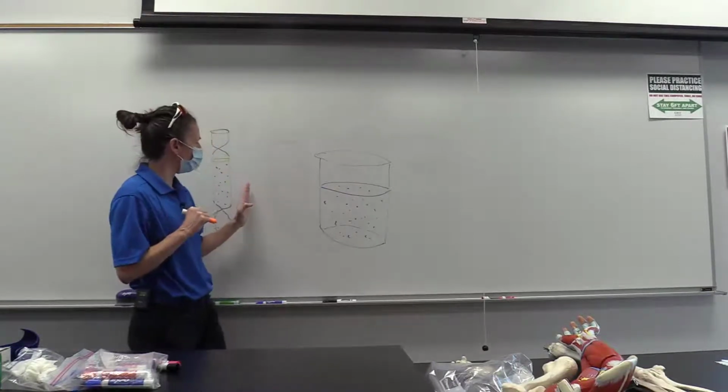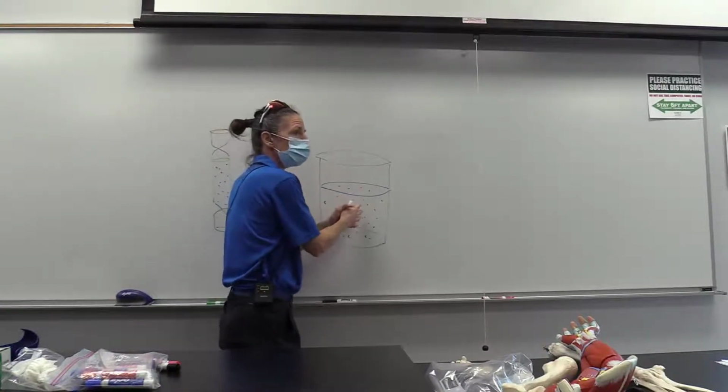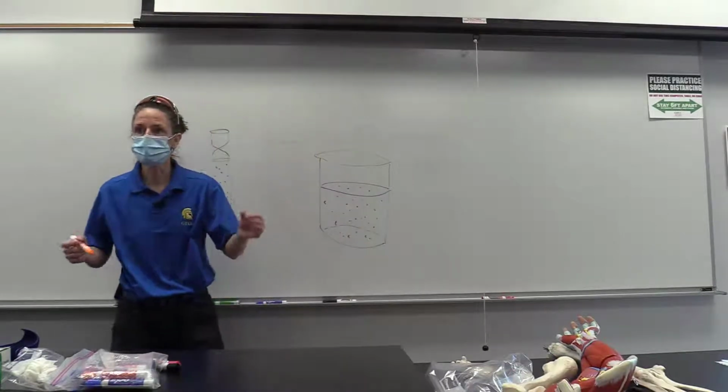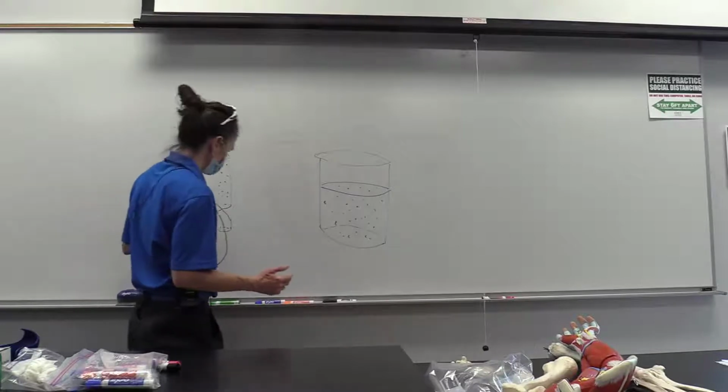The bag weighed less because there's more water in the bag proportionally to the beaker. And so the water left the bag and went to the beaker, right? So it makes sense. All right, he did another cool experiment to show diffusion.